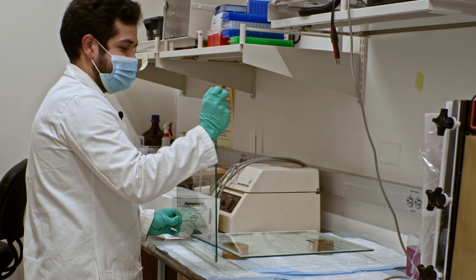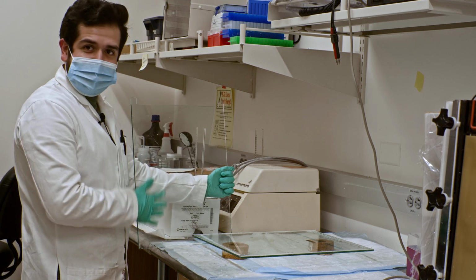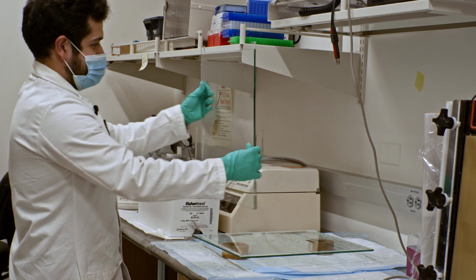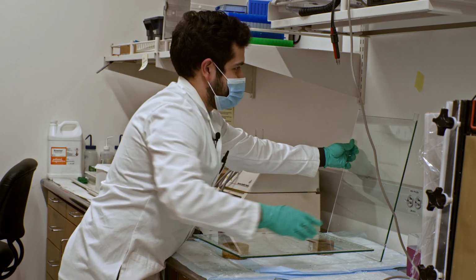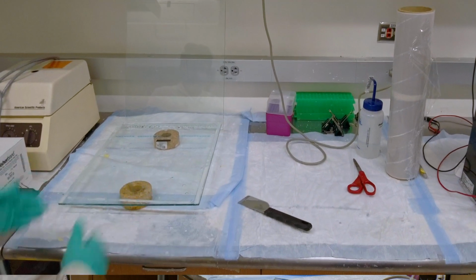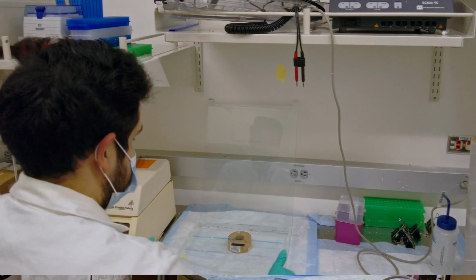As you can see, perfect. No gel is sticking to the top plate. There's no gel on the siliconized glass. And all the gel is on the other piece of the glass. So in other words, we had a perfect separation and lift from opening the gel.